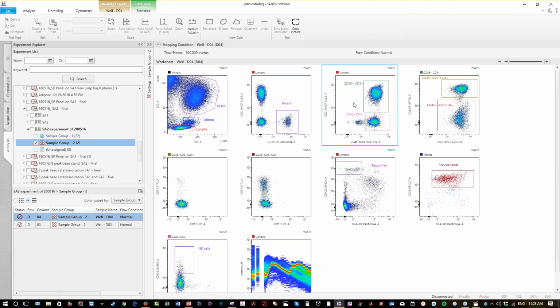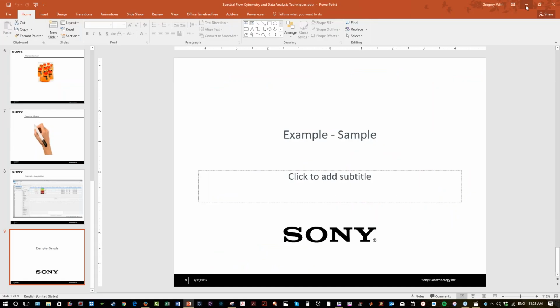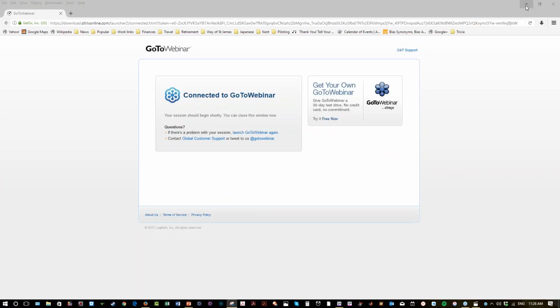Okay. So now that we've exported these files, Sean, we can now have you look at it. Great. Thanks a lot, Greg.